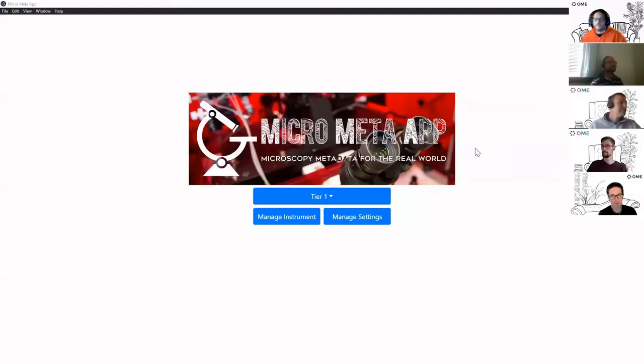There we go. So I was saying before, let's try to make it as interactive as possible. If you have any question, please feel free.